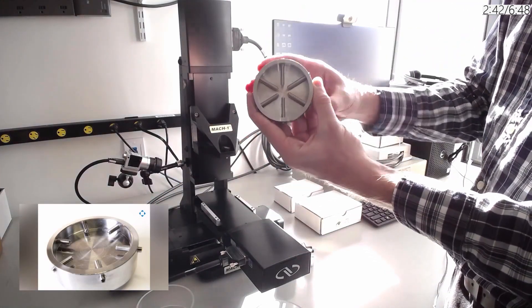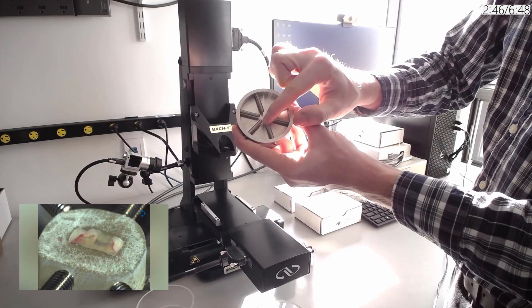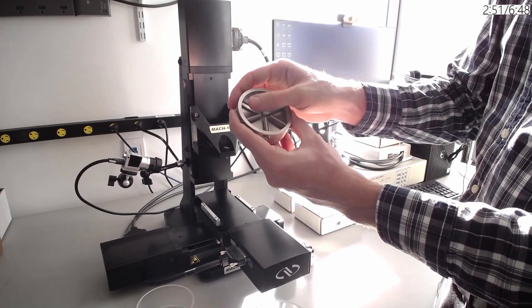Here's another example of a radial holder where these screws can go in and out so you can hold a sample with an irregular shape in the center below the load cell. These come in different sizes as well.